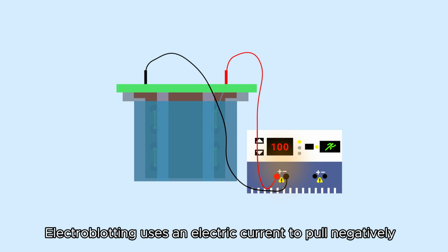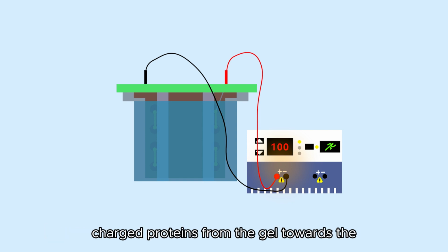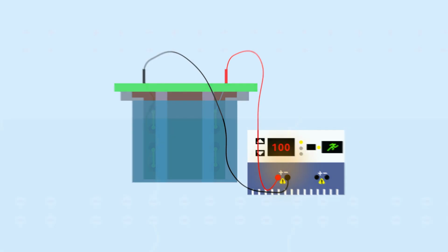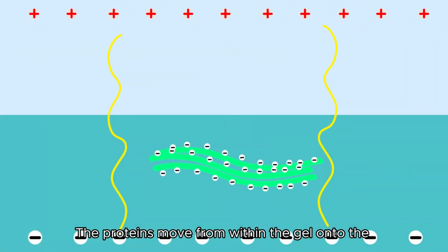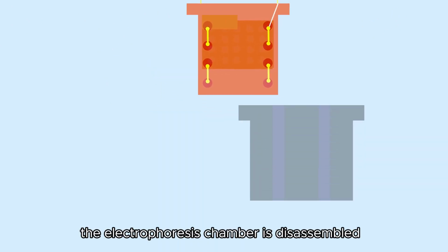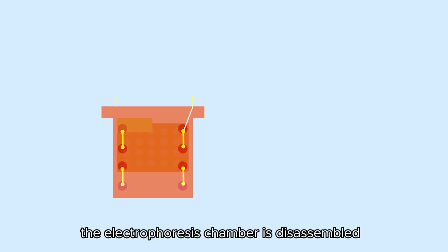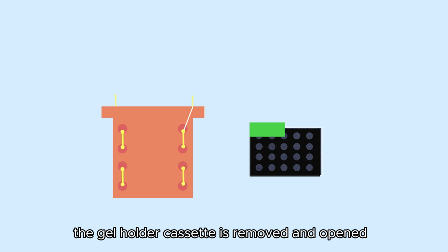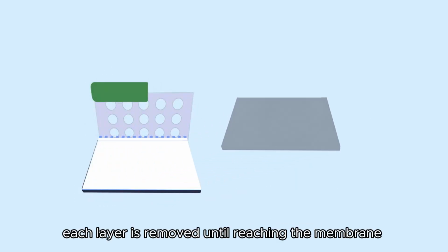Electroblotting uses an electric current to pull negatively charged proteins from the gel towards the positively charged electrode, transferring them onto the membrane. The proteins move from within the gel onto the membrane while maintaining the organization they had within the gel when the run is complete. The electrophoresis chamber is disassembled and the inner module is removed. Then, the gel holder cassette is removed and opened. Next, starting with the fiber pad, each layer is removed until reaching the membrane.